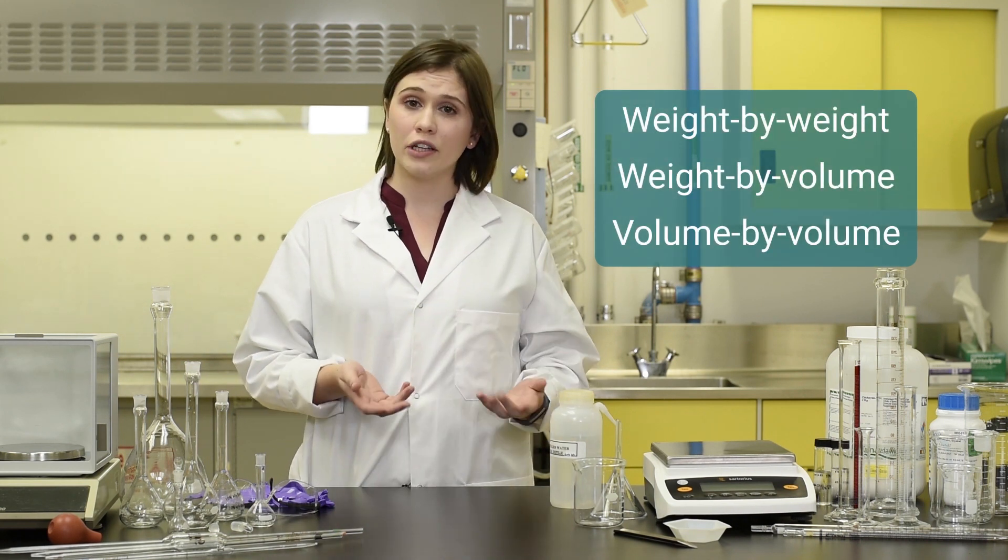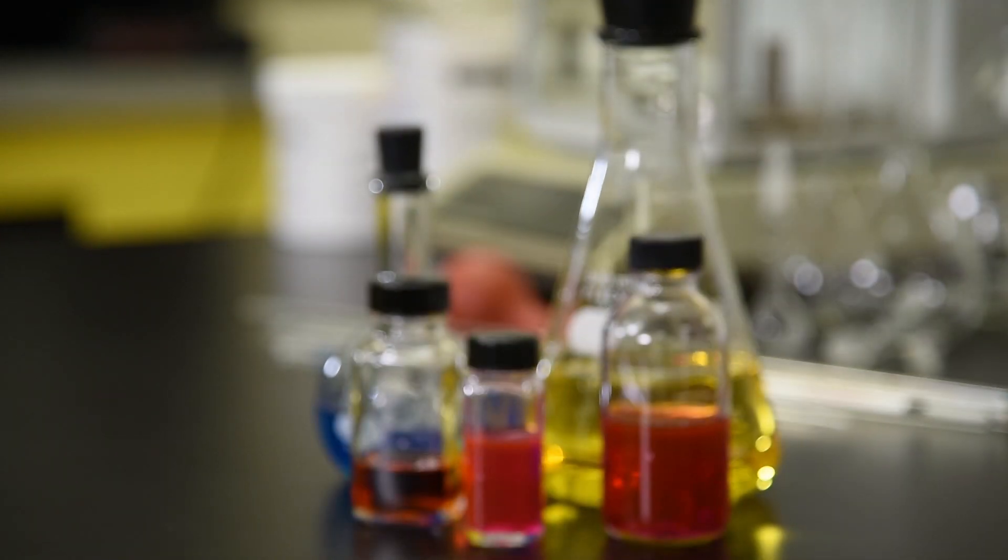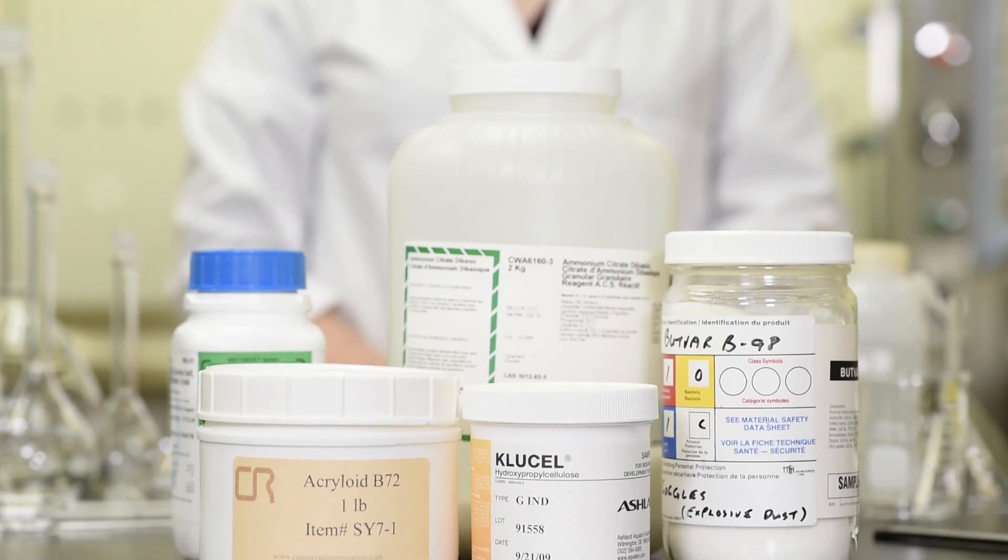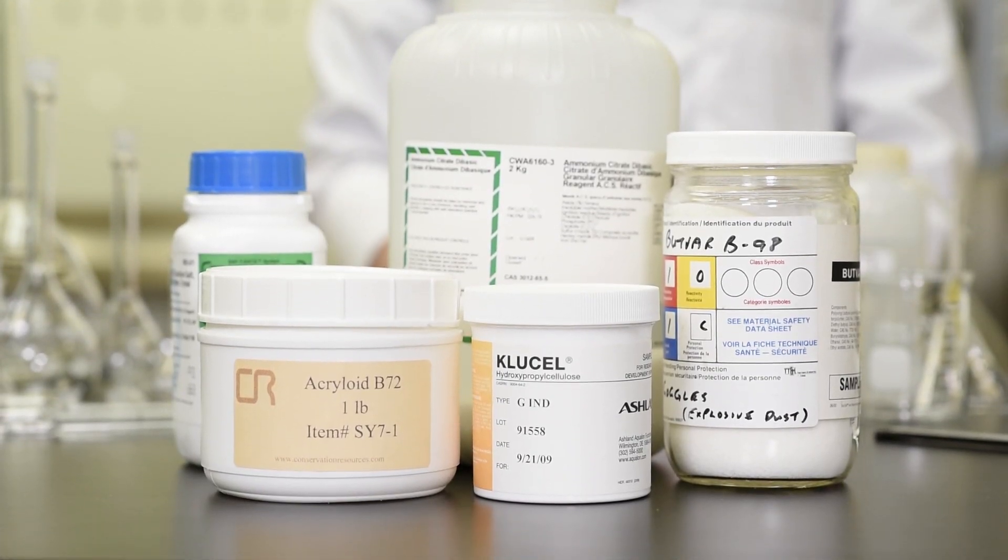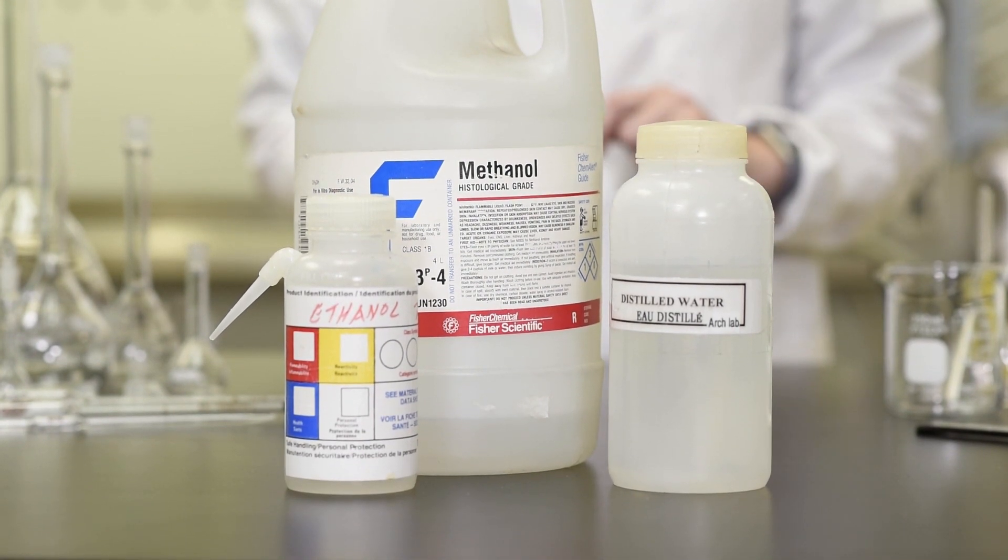Unlike in chemistry where concentrations are expressed in molarity, in conservation we typically use percentages to denote concentration, like weight by weight, weight by volume, or volume by volume. In a solution there are two components: the solute and the solvent. The solute is the chemical being dissolved or diluted, and the solvent is the liquid doing the dissolving or diluting.